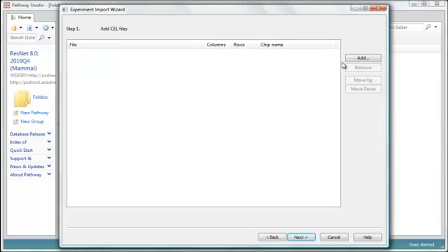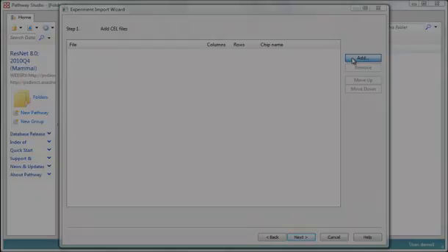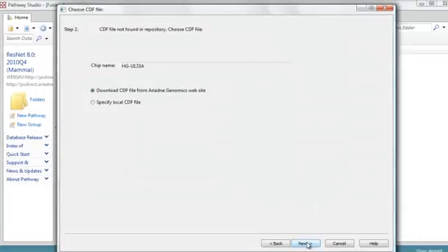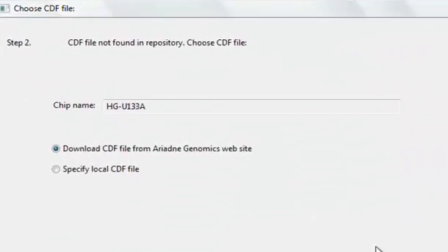Now I'm ready to pick the cell files. I'm ready to click Next.